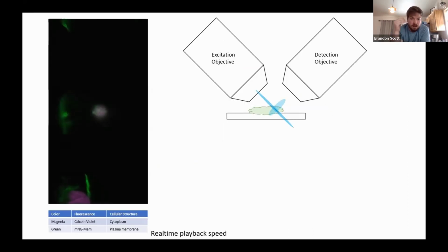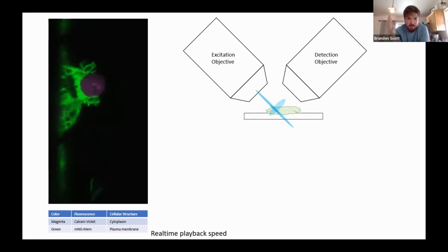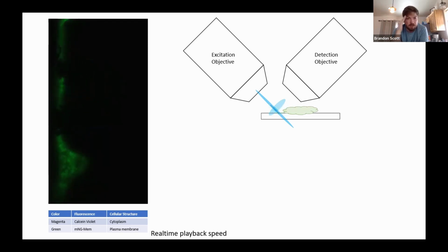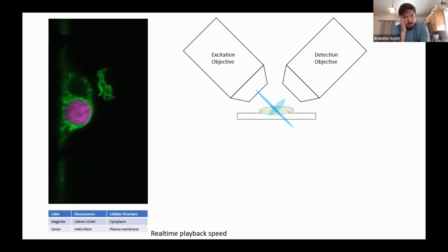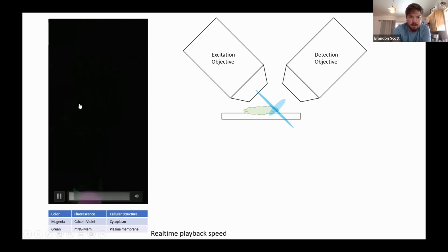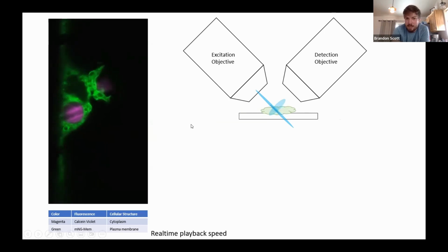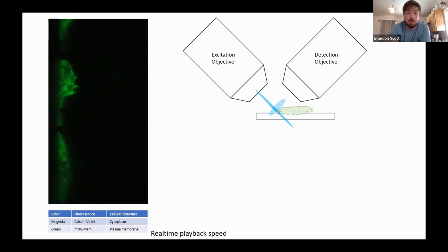And so everybody knows this, but I just want to show what it looks like as we get some data off of the Lattice Lightsheet microscope here. So some raw data. And the question really is, maybe for people who are new or not as well versed in this, these aren't exactly helpful slices to be looking at here in terms of this raw data. And so we have to take it from the raw data to something that is usable.